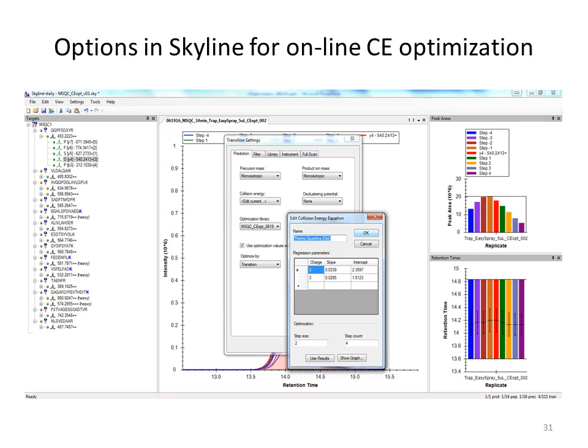So this is an example of optimizing for collision energy in Skyline using a chromatographic setup. And that's a lot nicer because you're not sitting there infusing a peptide with a syringe, cleaning it out, having to do that again. It's very time consuming. And so if you have the LC introduce it, even though your peak is coming out on a chromatographic time scale, the instrument's so fast, it can change collision energy on the millisecond time scale.